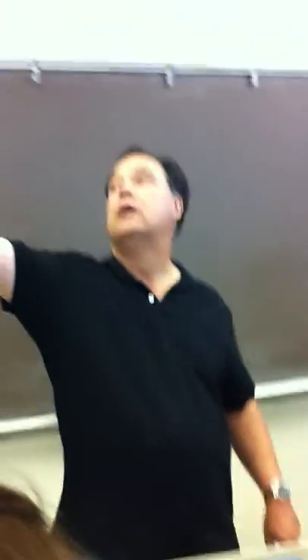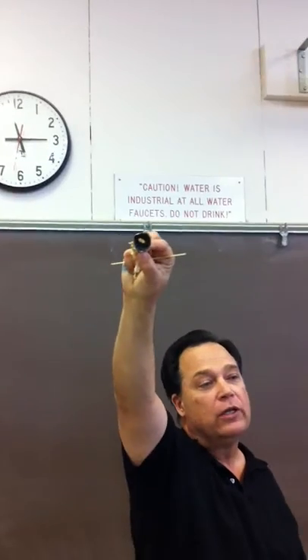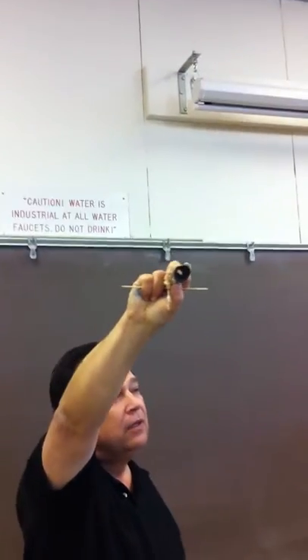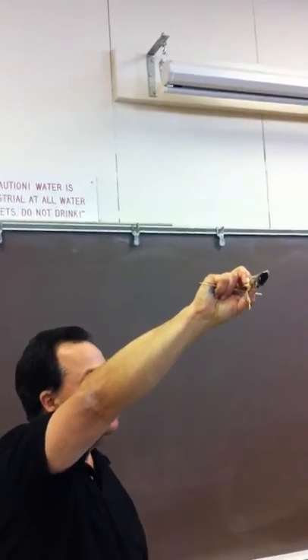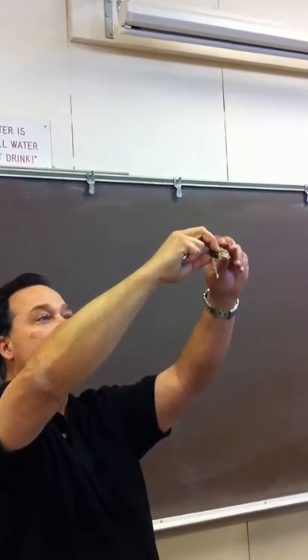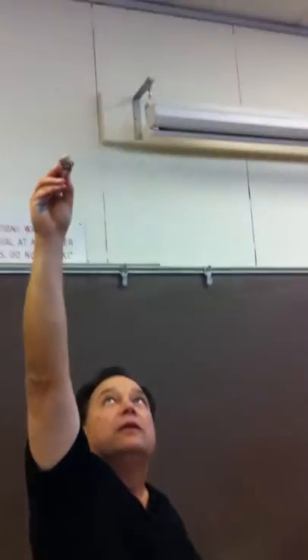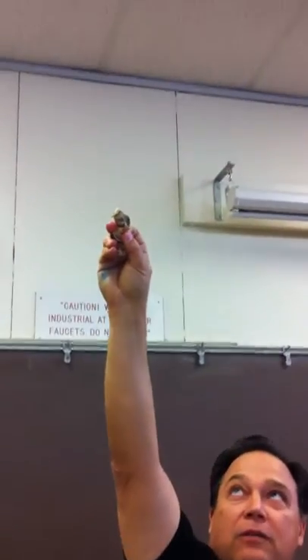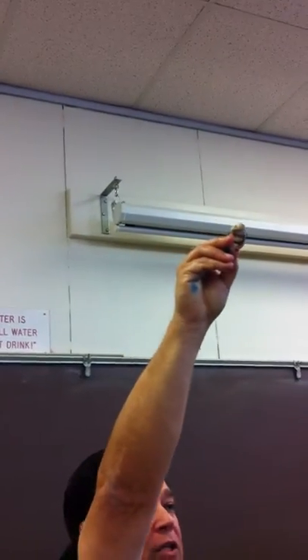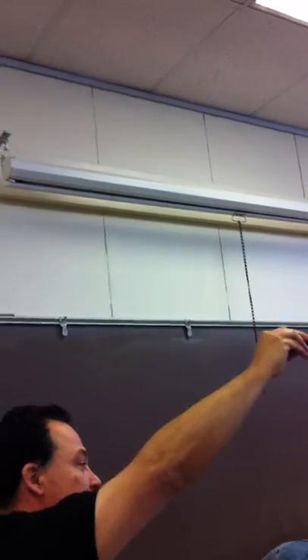That's the inside of the anterior portion of the eye. So that hole that you're looking out of is the pupil, and what you're seeing on the other side is the iris. You can look at it this way too where the light shines through. You can see there's the cornea, and the pupil's a hole, and around it would be the iris.